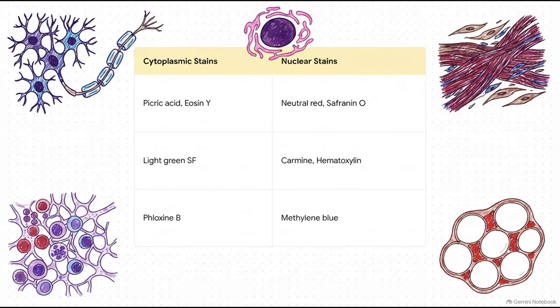And pathologists also use highly advanced specific stains to make specific architecture pop right off the glass. Things like Sudan IV or oil red O for lipids. For connective tissue, they might use Gomori silver, Van Gieson's, Masson's, or PTAH. For nervous tissue, Nissl or Luxol fast blue. And for bone marrow, they rely on Wright-Giemsa.